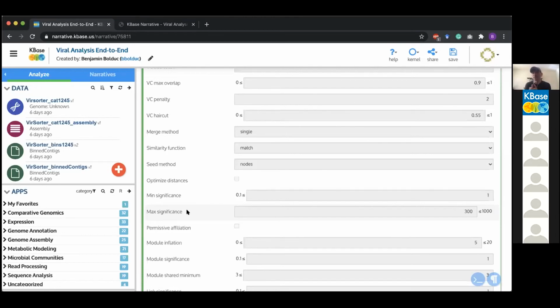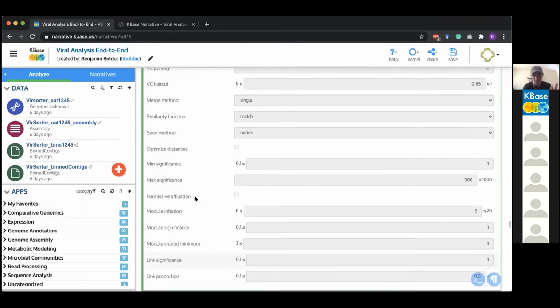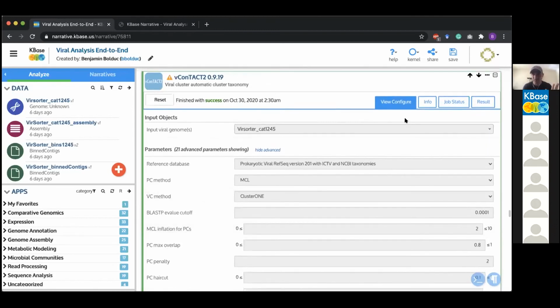So now you're not looking at 8 out of 10, you're looking at 80 out of 100 genes, let's say, relatively speaking. And now you share 77 genes versus sharing 83, so you have enough of a difference for the algorithm to correctly place those genomes into the appropriate viral clusters. So that's probably the only one I would change, just grossly going over this crazy quickly.